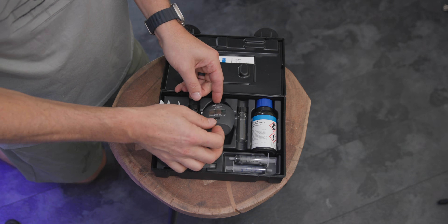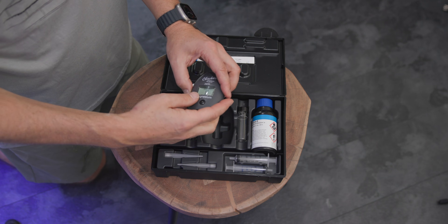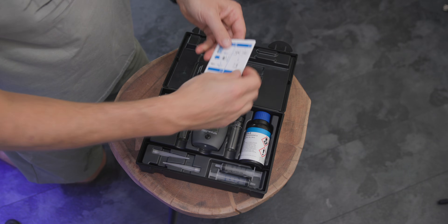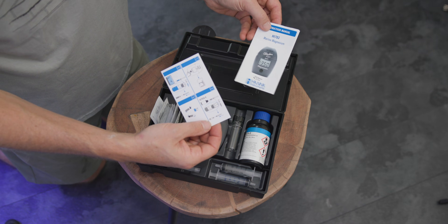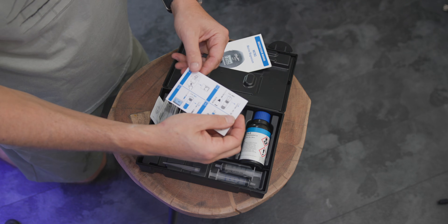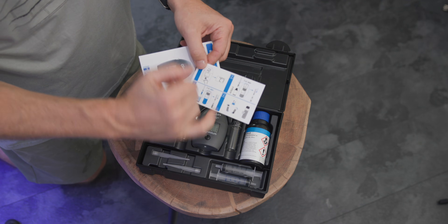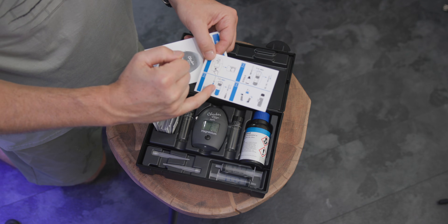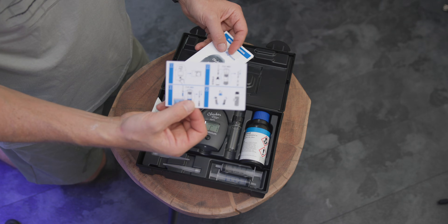I've already put the battery in. If you're buying it new, it's going to have a battery — you need a small Phillips head screwdriver. Something else Hanna's doing now that I like: you have a quick reference and a full reference guide. I'd recommend reading the full instructions first. There are notes in there, like using the black syringe with black markings versus the blue one. Once you're really familiar with it, then you can use the quick reference.